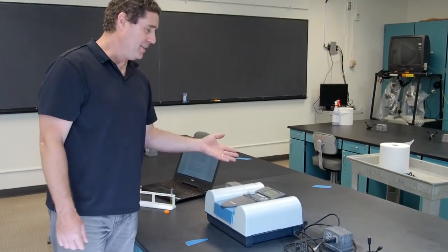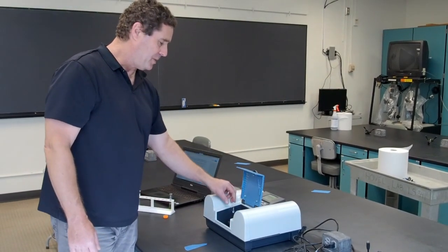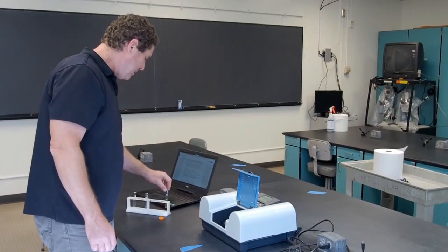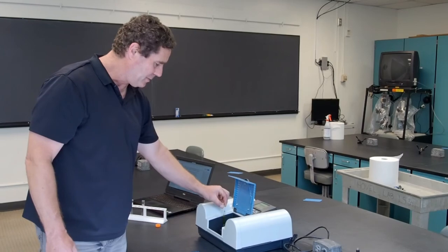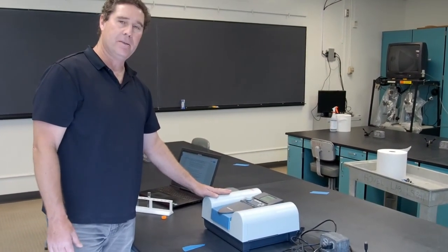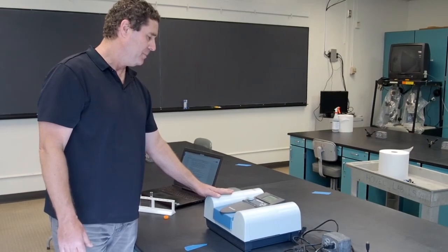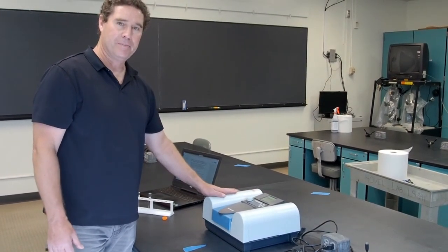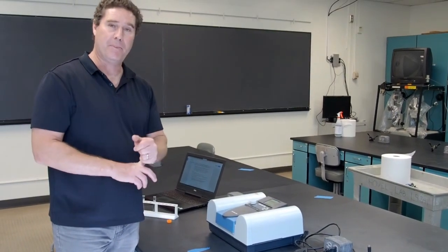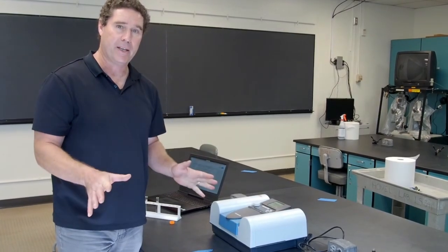Once it's ready, and it is, we're going to proceed the same way we did before. We're going to pull this out, handling this only at the top of the cuvette. We're going to put this in, let our machine read absorption, and record that number. And then, as you see from your handout, we're going to repeat that procedure for several other wavelengths and get an absorption reading at all of those wavelengths.